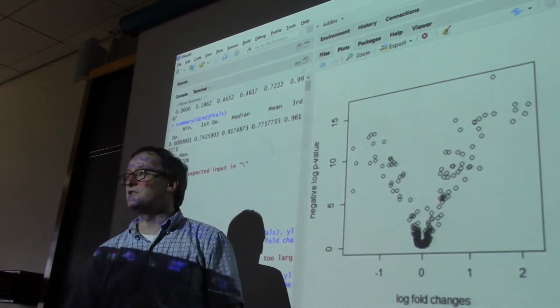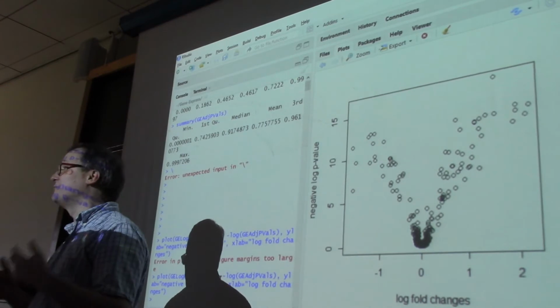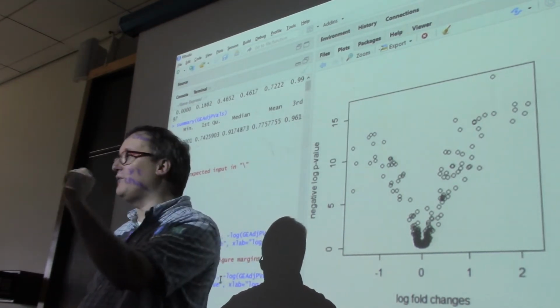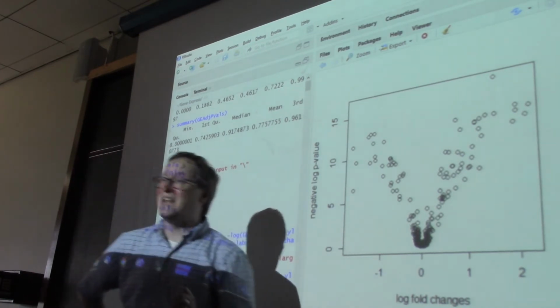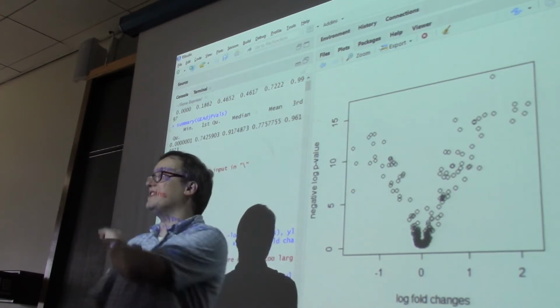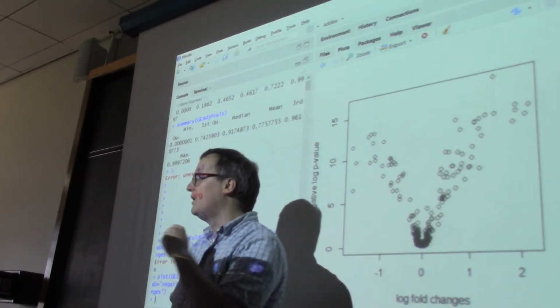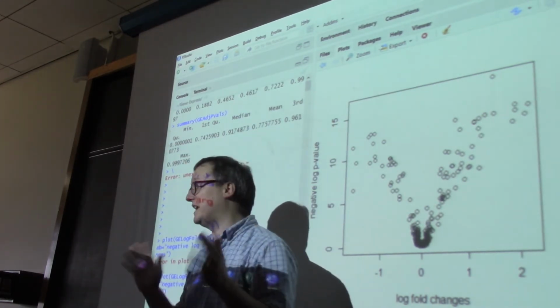On this axis, we're using the negative value. We've subtracted the logarithm of the p-value. That probably sounds completely arcane to you. But the thing that I want to tell you here is that the closer a p-value is to 0, the more we care about it. One of the ways to emphasize that really strongly is to plot them on a negative logarithm plot. You see this all over the place. In all kinds of bioinformatics, in all kinds of biostatistics, we find a negative logarithm is an easy way to transform p-values to highlight the ones we actually care about.